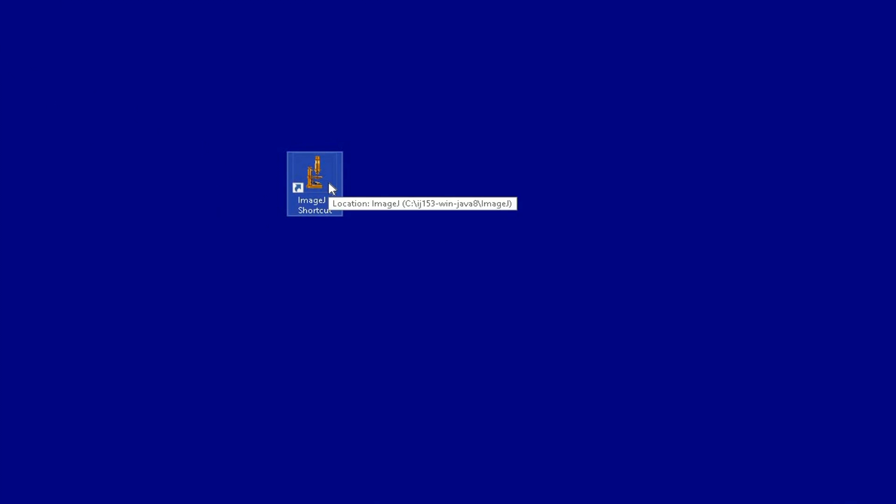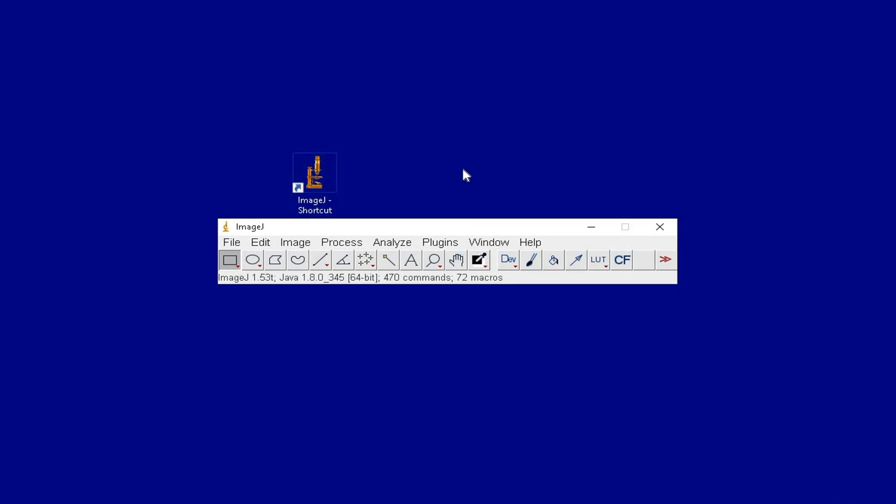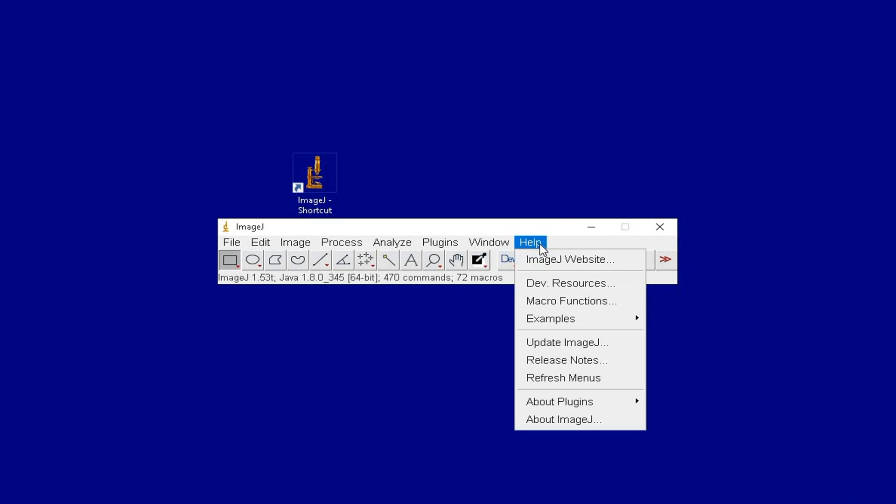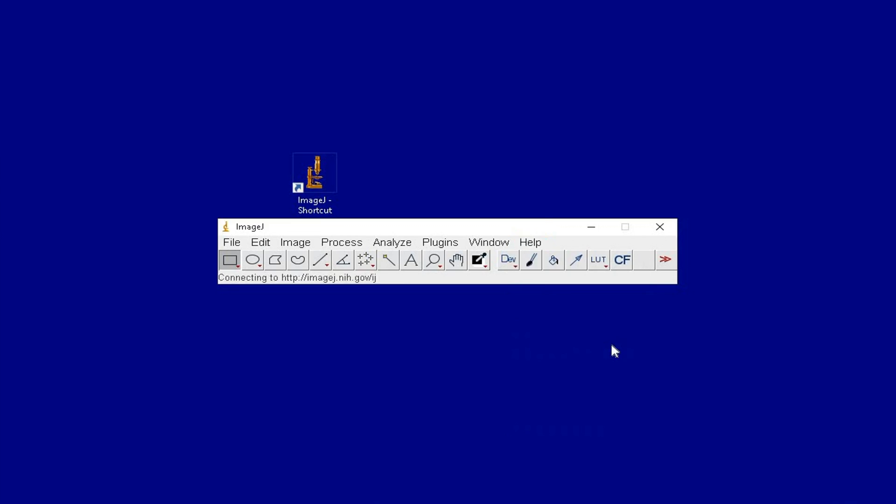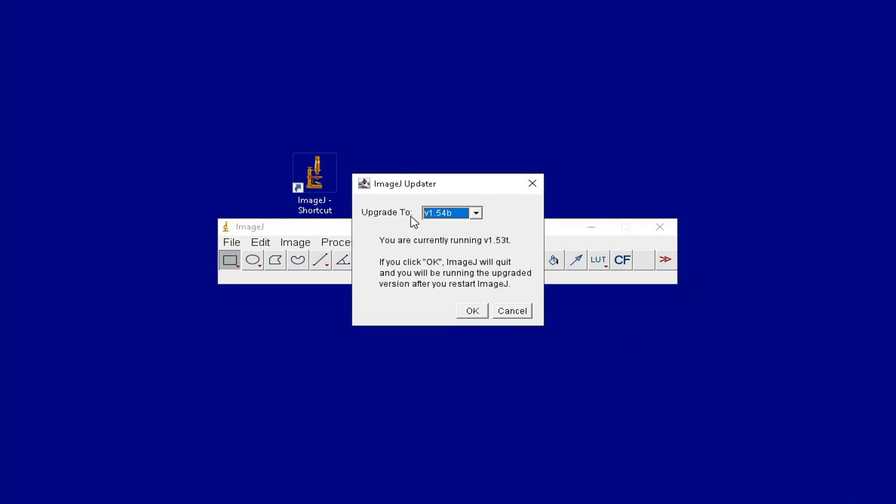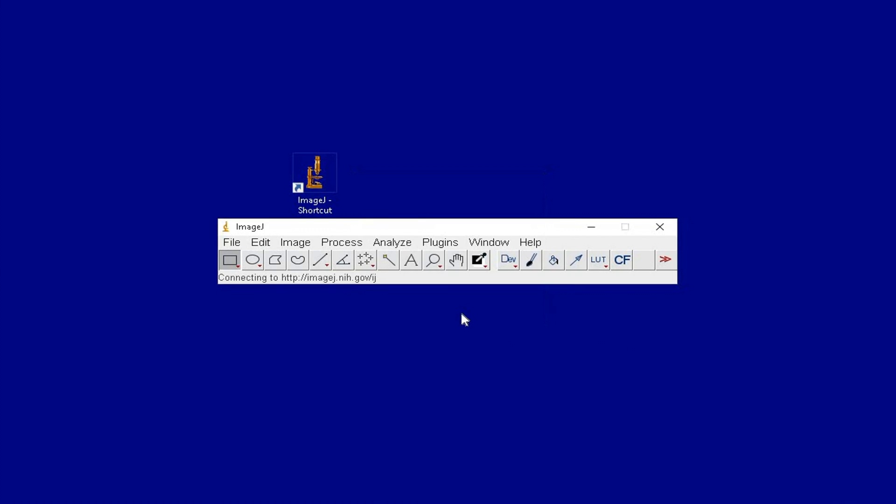Locate the ImageJ icon in the desktop and use the software. To update the ImageJ software, click on Help and select Update ImageJ. The ImageJ updater will prompt you to update to the latest version.